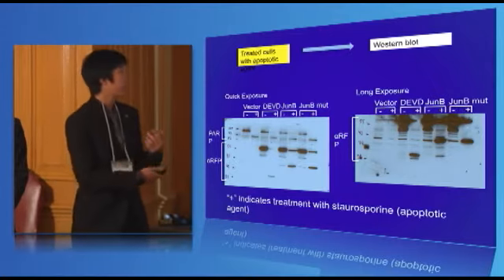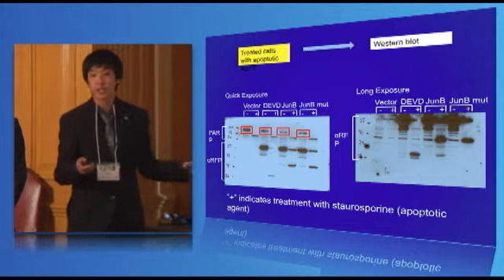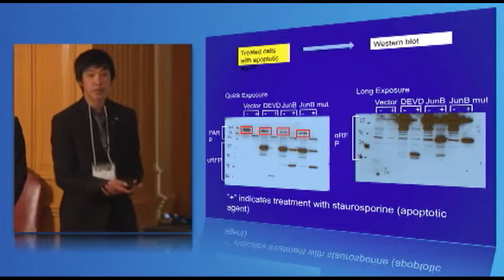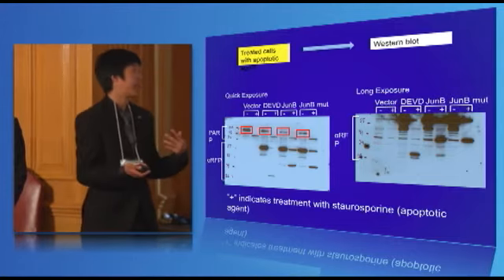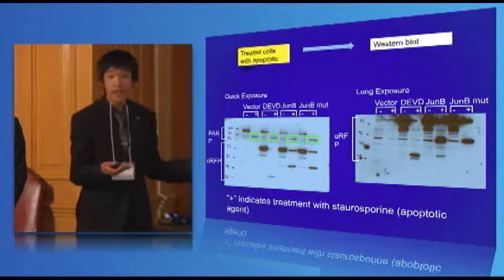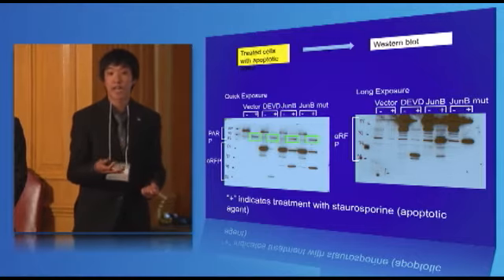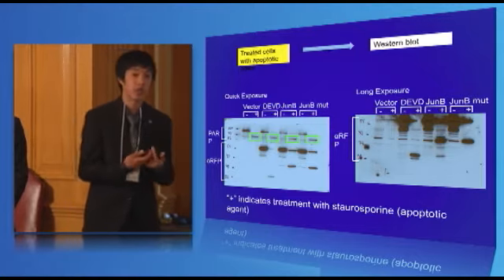So if PARP is cleaved, that means that caspases are present, and therefore our construct should also be cleaved as well. If you note, PARP occurs at approximately 130 kilodaltons prior to treatment with staurosporine. However, after it is treated, it is cleaved to approximately 95 kilodaltons. So this suggests that caspases were in fact activated, and therefore our construct should also be cleaved.